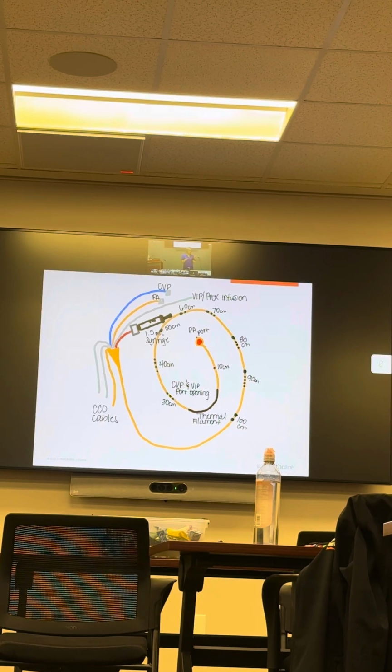You also have measurement markings on this guy here. So the skinny line is denoting 10 centimeters. So this is 0, the tip is ground 0. Then I have one skinny line here, that's 10. Our thermal filament we talked about, he's covering 20. 3 skinny lines, 30. 40. And then you run into one thick line, 50. All right? Then it gets like Roman numerals. There's a fat line and a skinny line, 60.